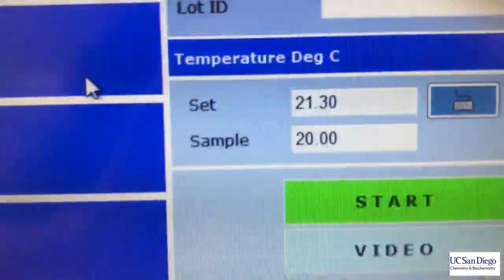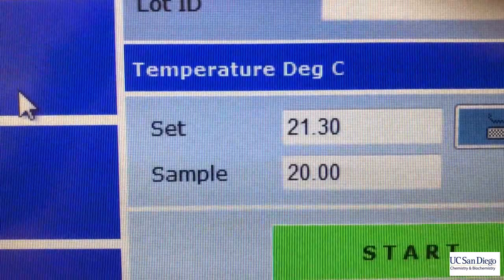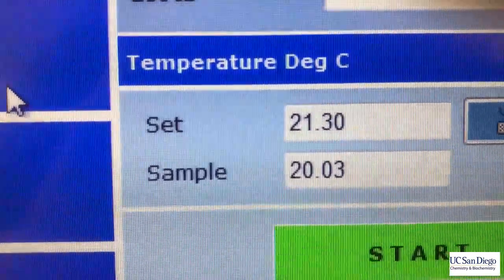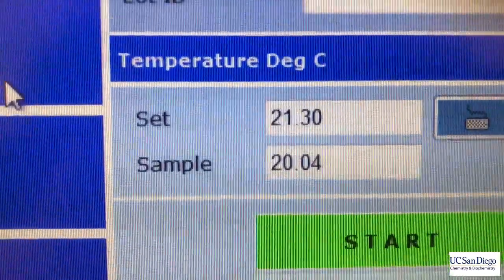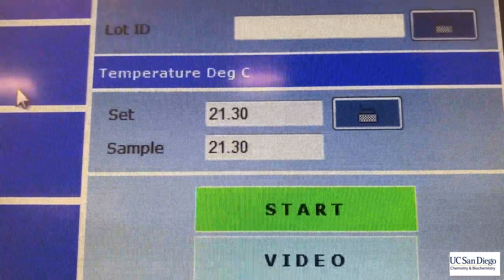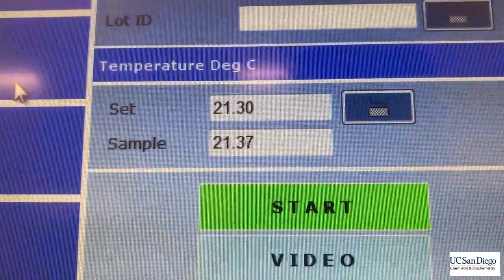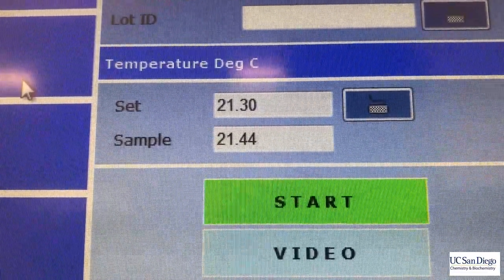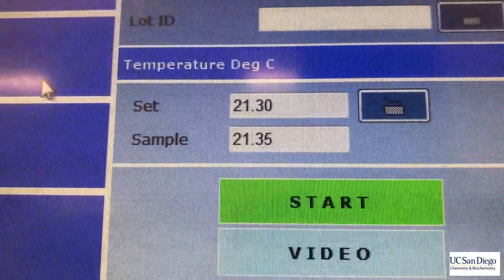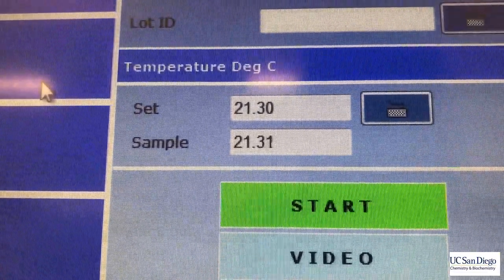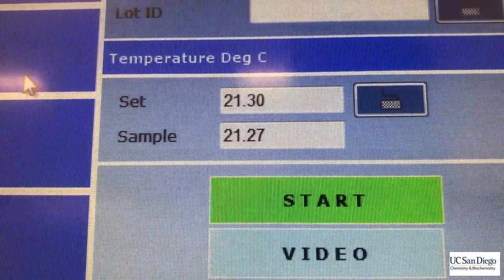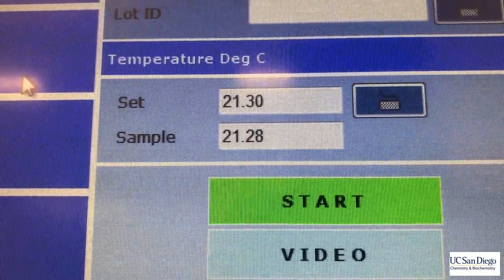Notice that it will take some time for the U-tube to equilibrate to the temperature you set — this is sped up, of course. The temperature will overshoot your target, don't worry. It starts to come back down and will overshoot again, but eventually it will equilibrate. Just be patient.